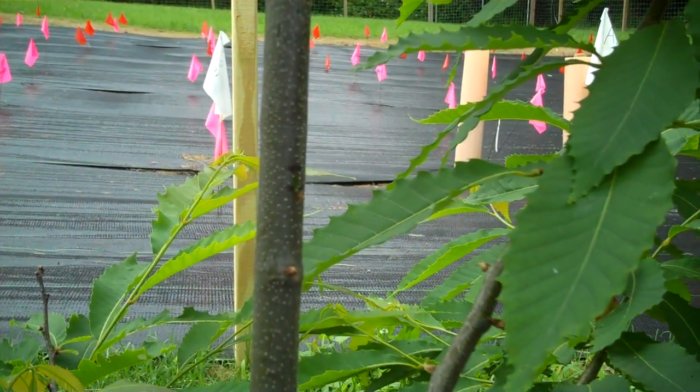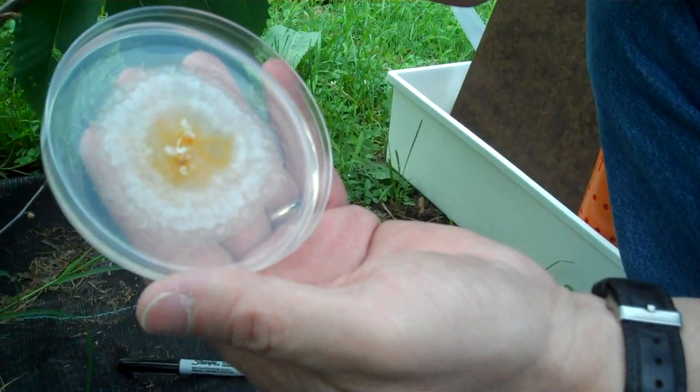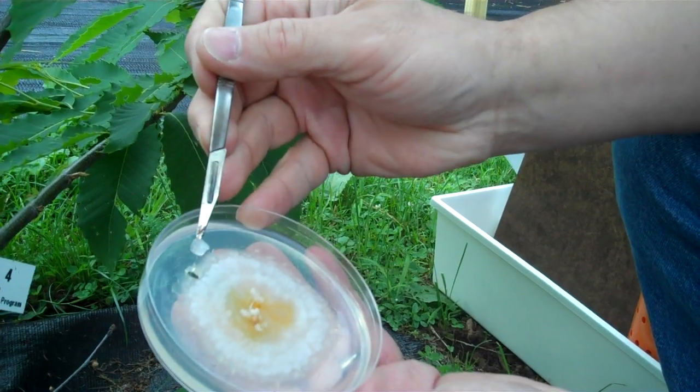Then I'm going to take the culture that has grown. We're taking plugs from the outer margin of this culture and we're going to take one of those plugs, such as that.